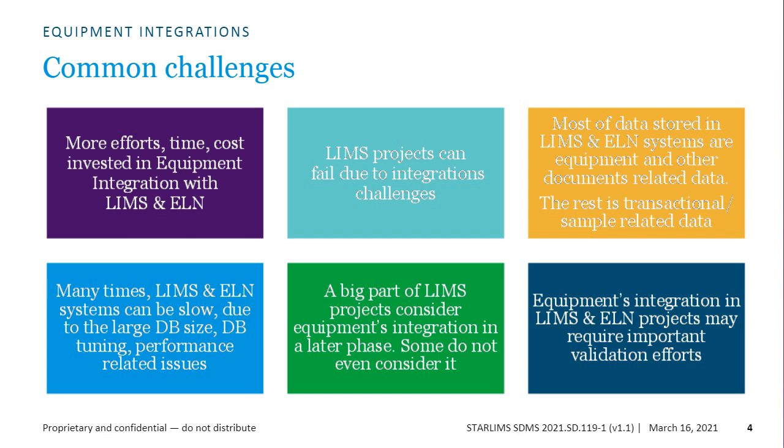They do not have native integration capabilities. You make them work, or vendors make them work, with the instrument integration. And most of the LIMS projects can fail due to integration challenges at a later stage.